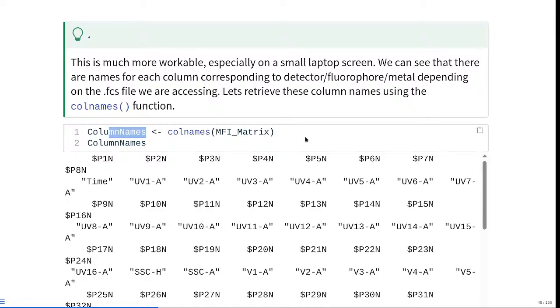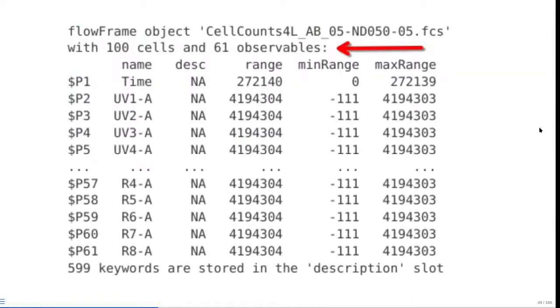And click here. So if we're looking back at what we had for the read.fcs function, we see we do have similar objects listed on the side. So name is corresponding to basically what we're seeing for those column names. But then those numbers that we're seeing on the side do match with what we saw when we did grab those objects. So we think they might be somehow trying to refer back to them.